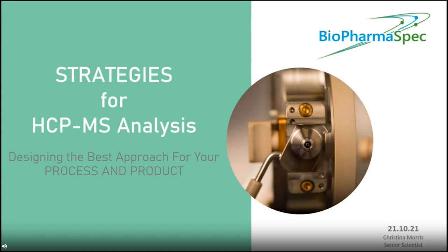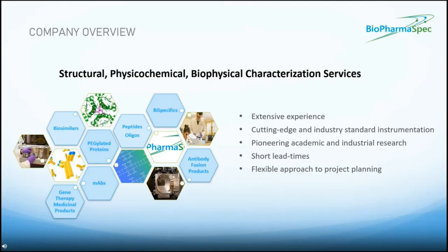So hi, and thanks for the kind introduction. Good morning and good afternoon to everyone. Our talk today is on strategies of host cell protein analysis using mass spectrometry, where we're specifically focusing on ways to design the best approach for your process and your product.